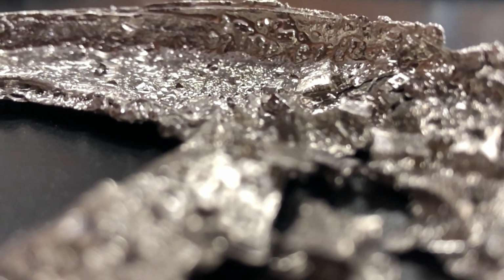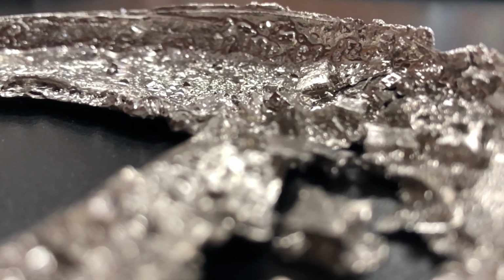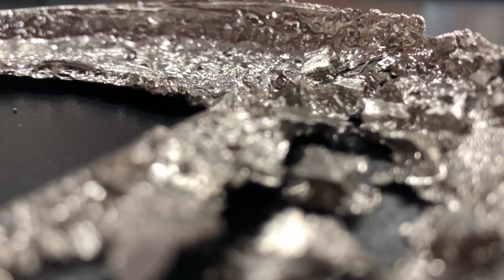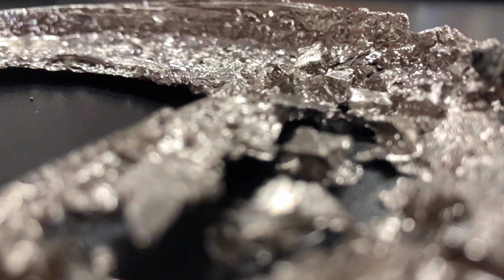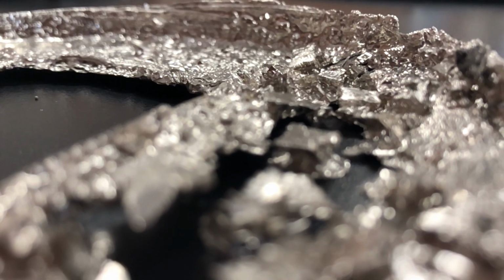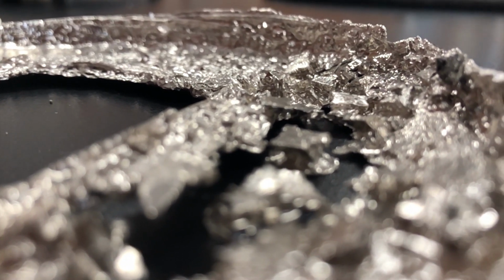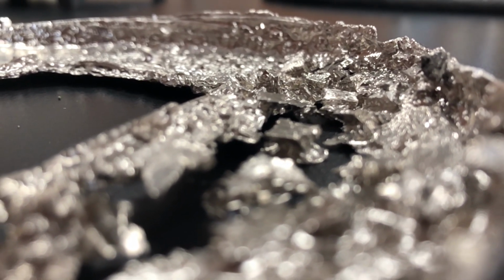Physical changes were physical changes because they didn't actually change the chemical identity of the substances. For example, the melting and crystallizing of bismuth was a physical change because it only changed the state of matter of the bismuth, not the chemical identity. There was no evidence of any new substances being created, like gas or color changes, which are both indicators of chemical changes.